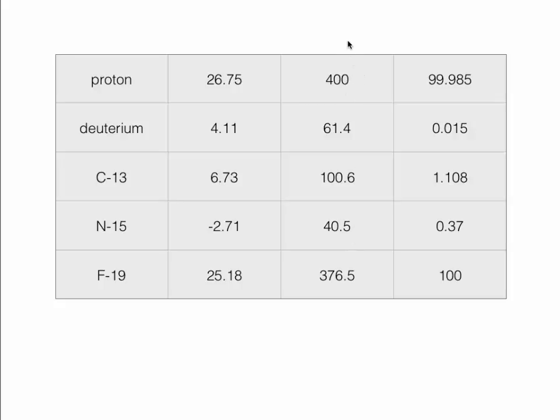So each experiment is going to be specific to the isotope you're looking at. There's going to be no crosstalk between them in terms of gaining signals. The other thing is that the signal is going to be immensely weaker for the deuterium. You may need to enhance your deuterium, but even then, the basic field strength is only going to be less than 1/6 as large. If the strength of the signal is only 1/6 as large, you're going to need to use 36 times the number of scans to get equivalent signal to noise. And so that's a big barrier.